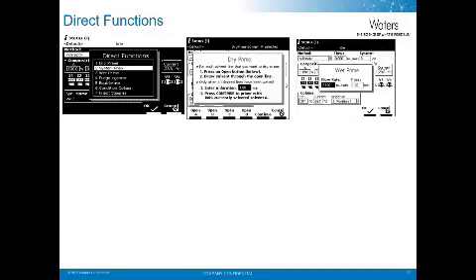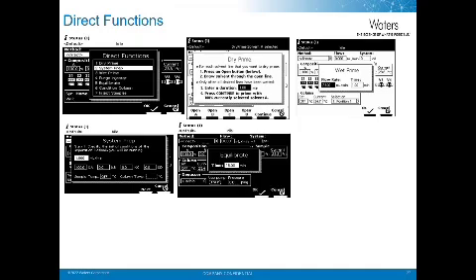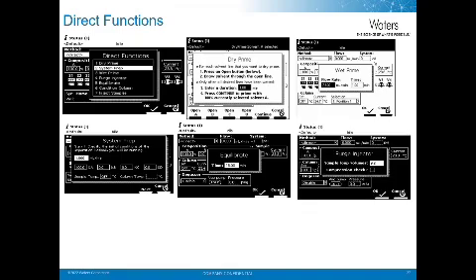Wet prime, system prep. Also, some more useful functions are equilibrate. This allows the system to pump and equilibrate the system to initial conditions. Purge injector. This purges the sample loop and injectors and can also perform a compression check.